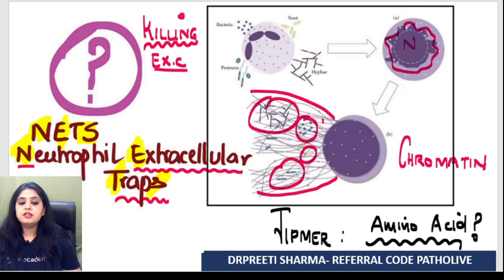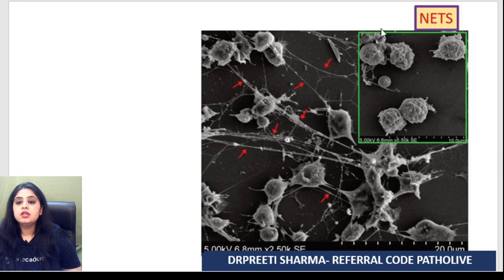Okay, having said that, what is the image that you get? This is one kind of an image, the black and white picture.